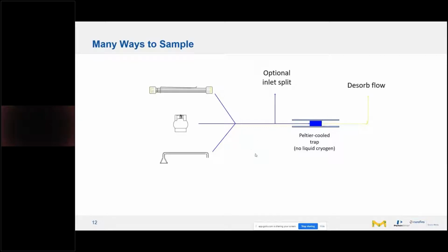There are many ways to sample. In this instance, for terpenes, we have a tube filled with adsorbents where the targets of interest will absorb onto the absorbents during the pumping process. We can also many times put sample in a tube to check for off-gassing at different temperatures.